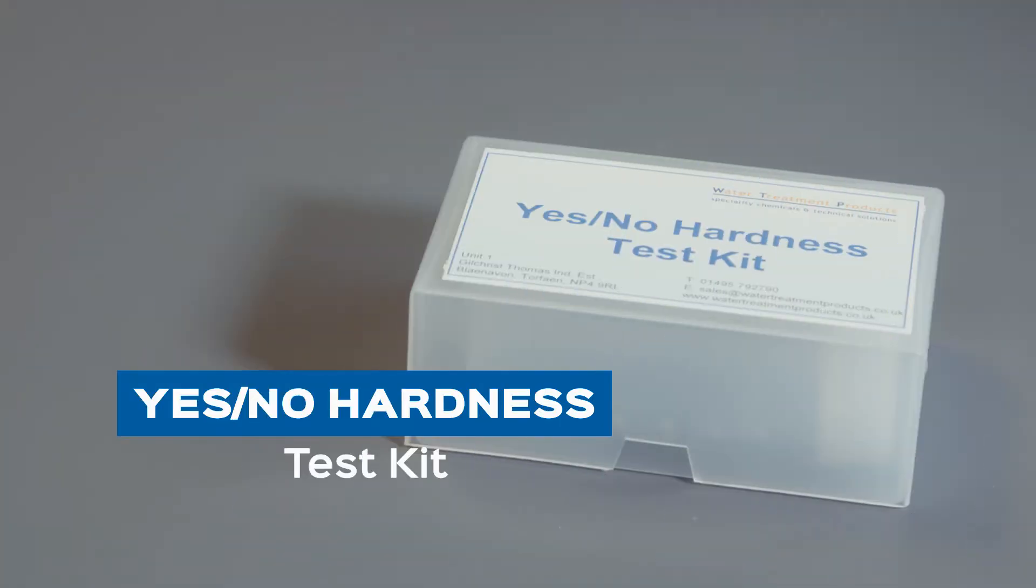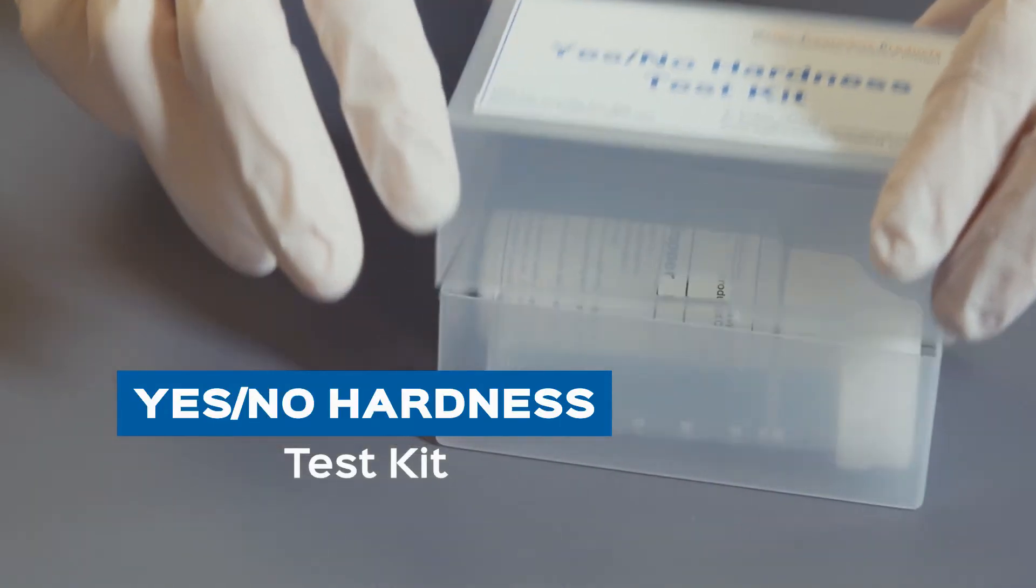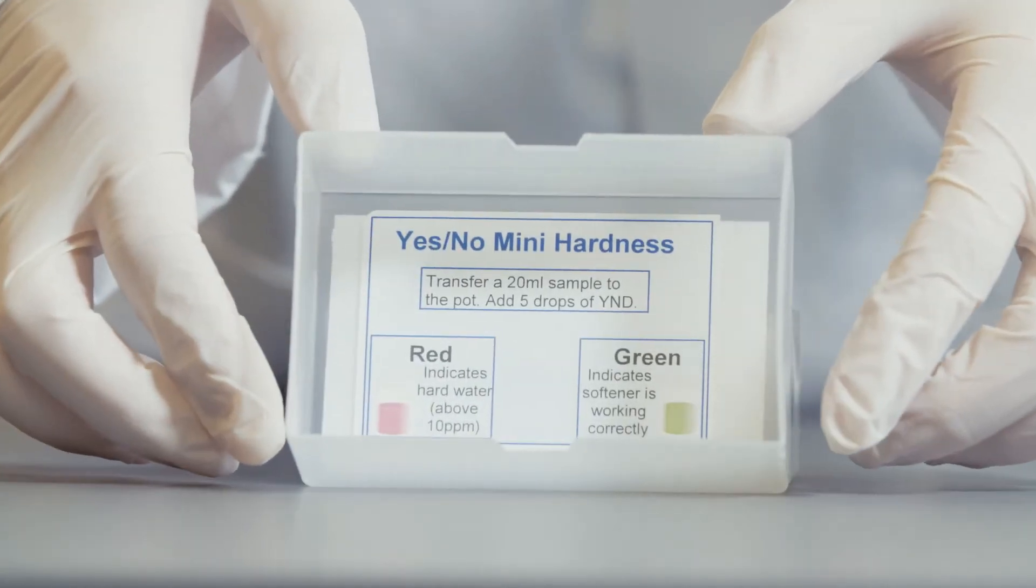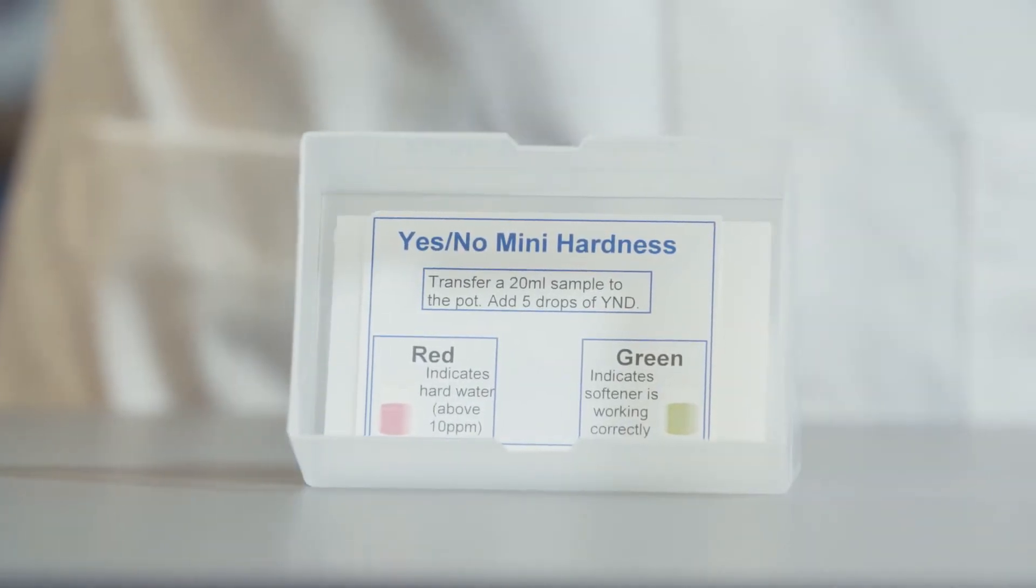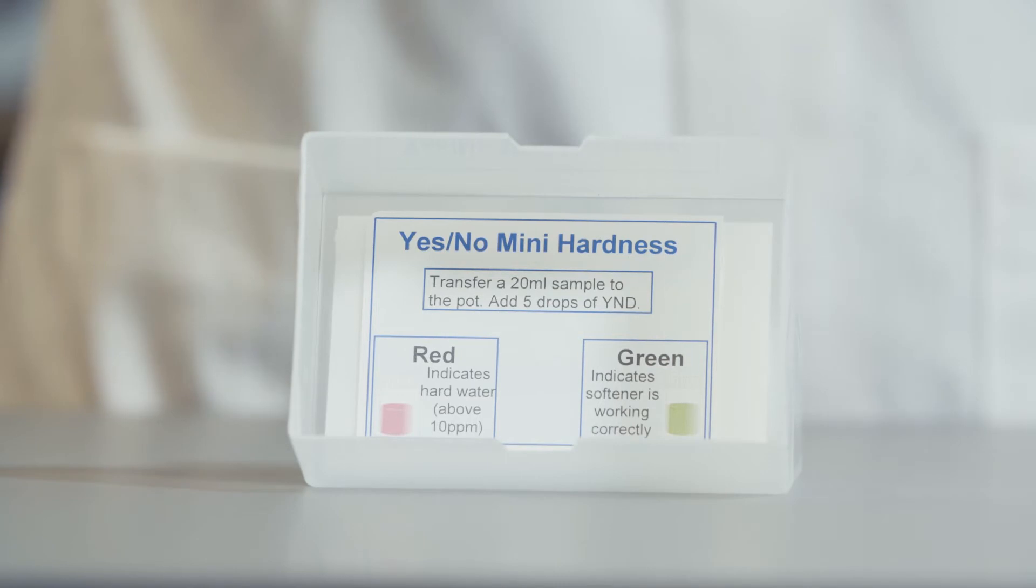This is an explanatory video for using the WTP yes or no hardness test kit. The test kit contains simple to follow instructions and all equipment necessary for carrying out a yes no hardness test.